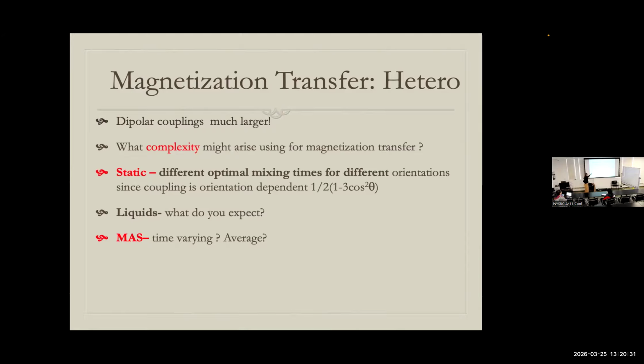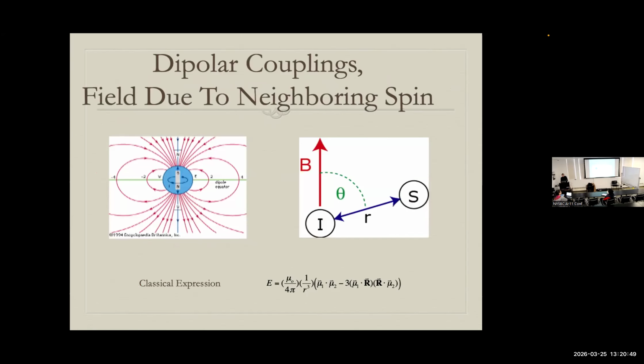Okay, anyway, if you're really at the magic angle, what's our dipole coupling average? I'm going to spin nice and fast, so the dipole coupling goes to 0. Yes, thank you. It goes to 0, it doesn't have any terms that are retained.